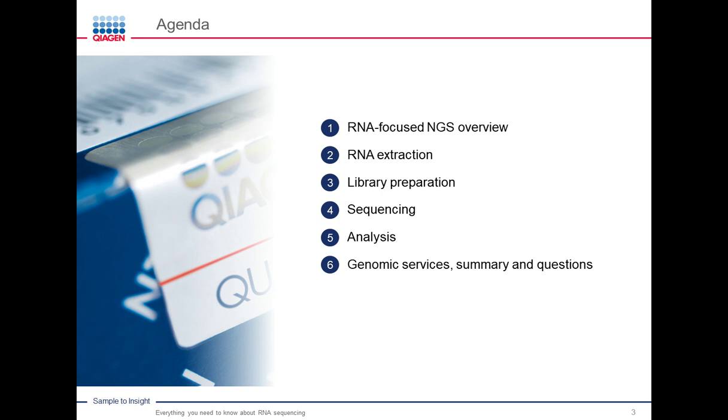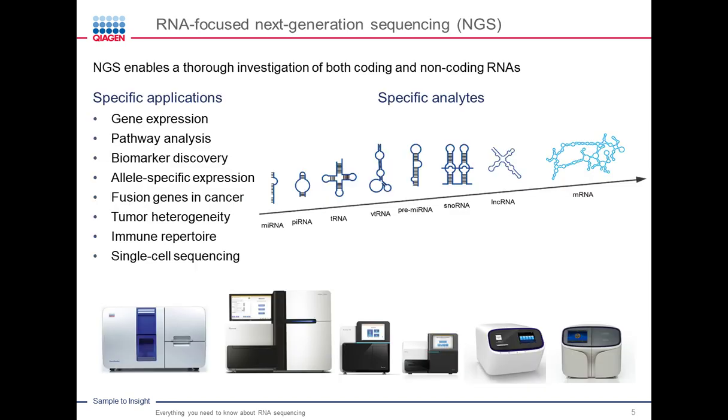We'll begin with an RNA Focused NGS overview, and then we'll discuss RNA extraction, library preparation, sequencing, analysis, and finish up with a brief discussion about Genomic Services, a summary of today's talk, and then we'll go into any questions that you have. So first off, let's take a look at RNA-focused NGS.